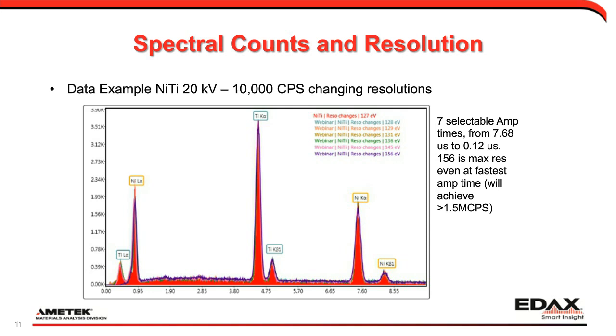And so the sample dependency, of course, is what it's made out of. If you have a low atomic number type of sample, then you will generally have more X-rays absorbed within your sample, less escaping. But if you have something nice like titanium, for example, you would have much higher count rates.